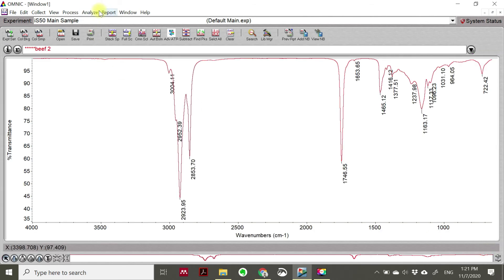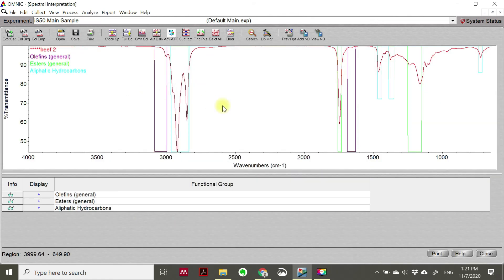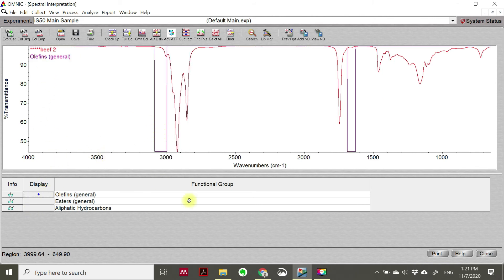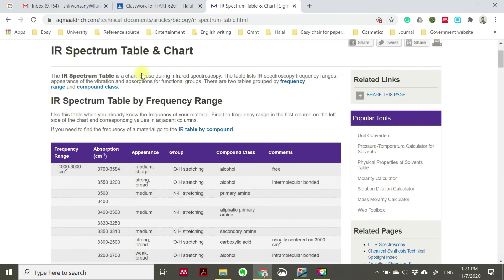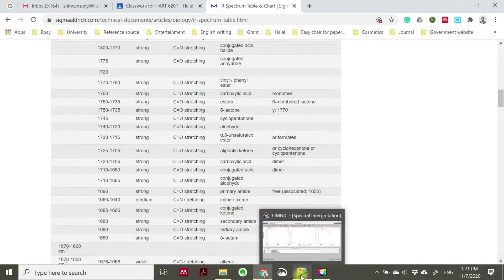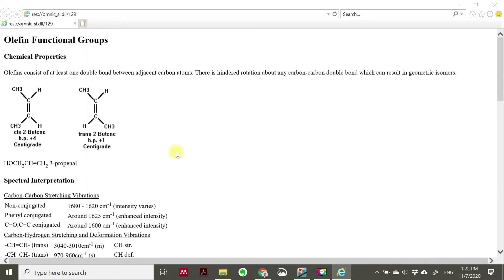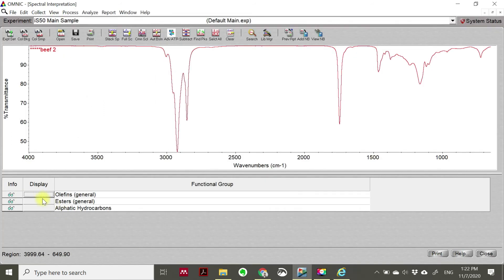We also can do IR spectrum interpretation. I just want to click one by one. Remember we are using the table to identify the possible functional groups, but using the software it can also identify them for you without referring to any chart. For example, if I click here it shows that you have a small olefins in your sample. You can click 'Info' - olefins consist of at least one double bond between adjacent carbon atoms, meaning you have a C=C double bond in your sample.